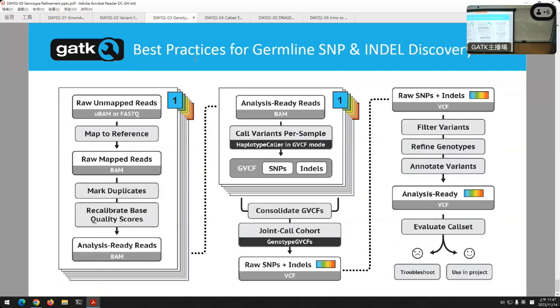So that for now is this part of the process. We have filtered genotypes, we've refined them, and finally we have a call set that we can sit down and tell you whether it's a good call set or not. And with that, I'm going to take questions and ask Aaron to come in from the other side. Oh, and here's Aaron. So, questions for anyone about genotype refinement?